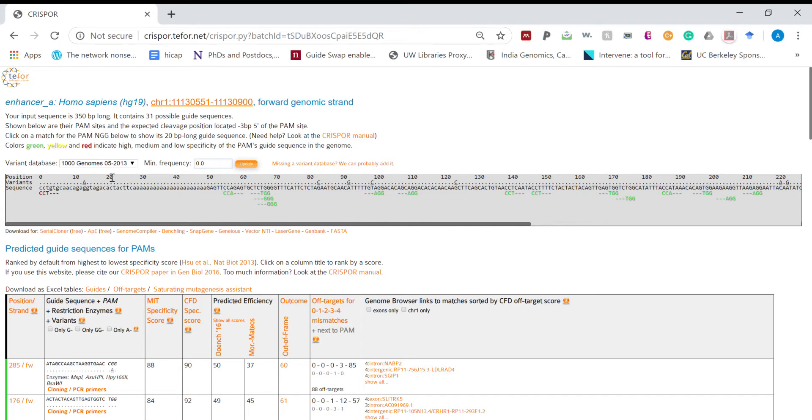So here we can observe there are three types of guides predicted: one which are green in color, then red in color, and yellow in color.